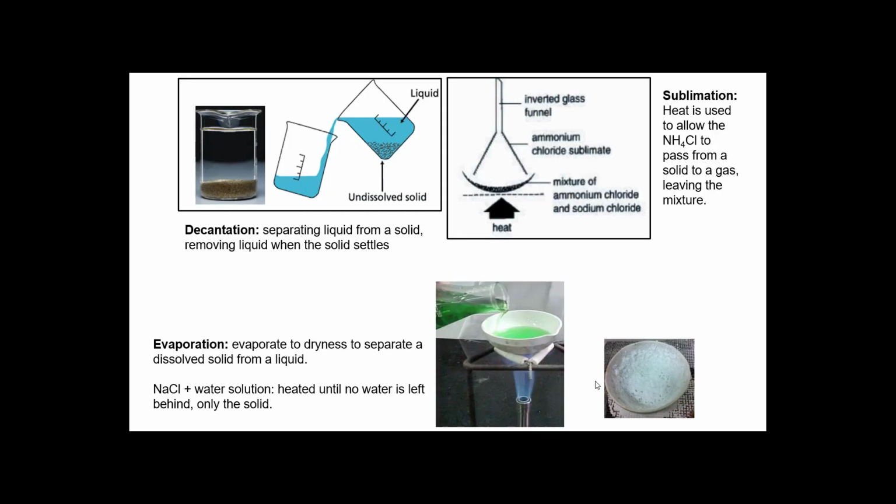Next one is decantation. This is when you have a solid liquid mixture and you let it settle. So this takes a little while. You need it to completely settle out so the solid will sit at the bottom. Then once it's sitting at the bottom, you very carefully and very slowly, you don't want any vibrations or movement, you decant the water, in this case this water and sand.